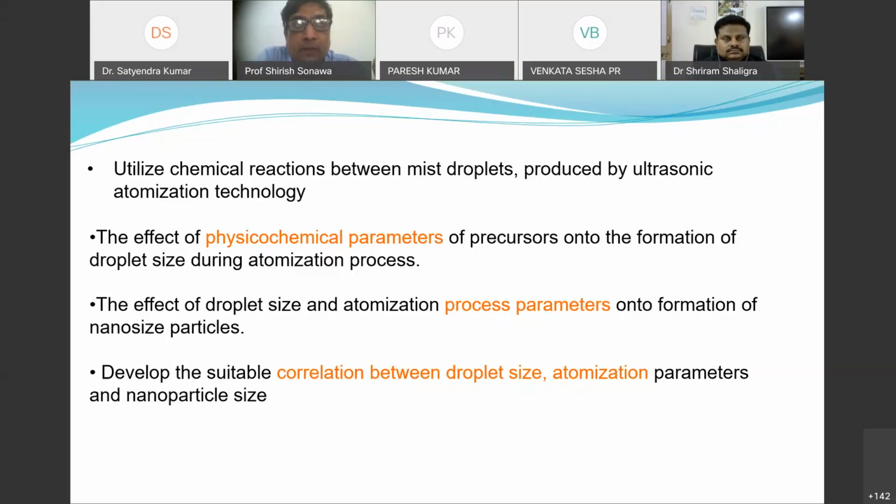It is a very well-known correlation by Professor Lang, based on the atomization process. It contains the surface tension, viscosity, density of a particle, and the orifice size. Okay. So how this correlation has been developed, I will just explain to you.